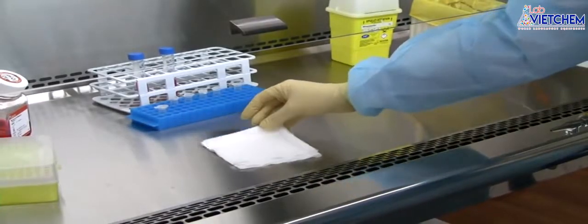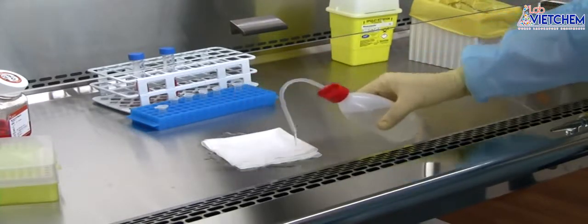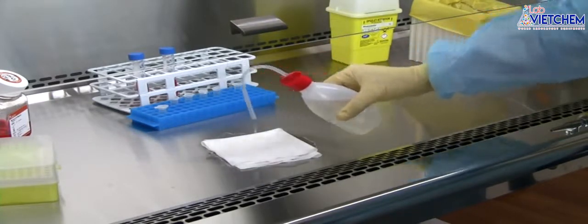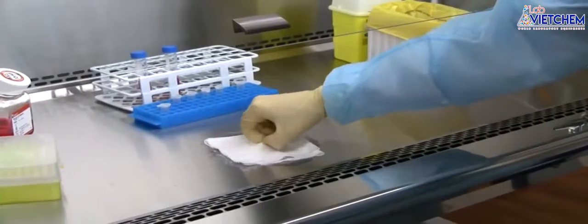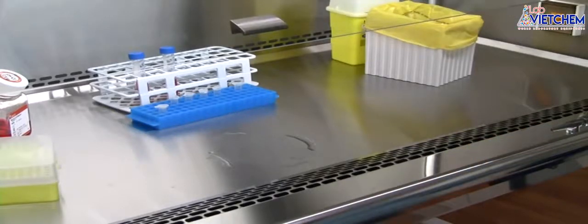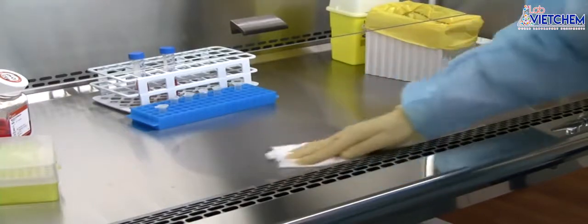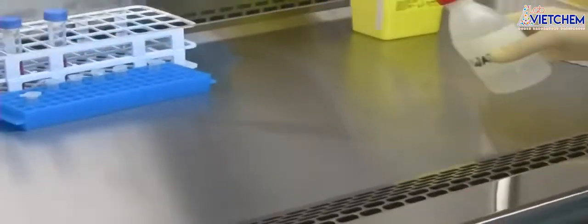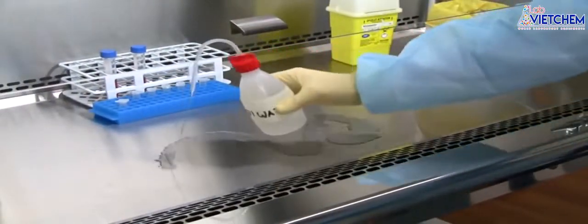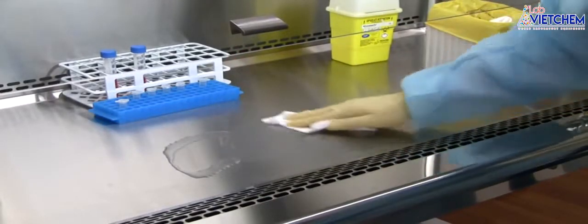Completely cover the spill with a towel and soak with a 10% bleach solution working from the perimeter to the center of the spill. After allowing 15 to 30 minutes for contact time, wipe the surrounding exposed surface and equipment with appropriate decontaminant. Contact time will depend on the microorganism and the decontaminant. Remember to clean the bleach using sterile water afterward, as it might cause discoloration on the stainless steel surface.